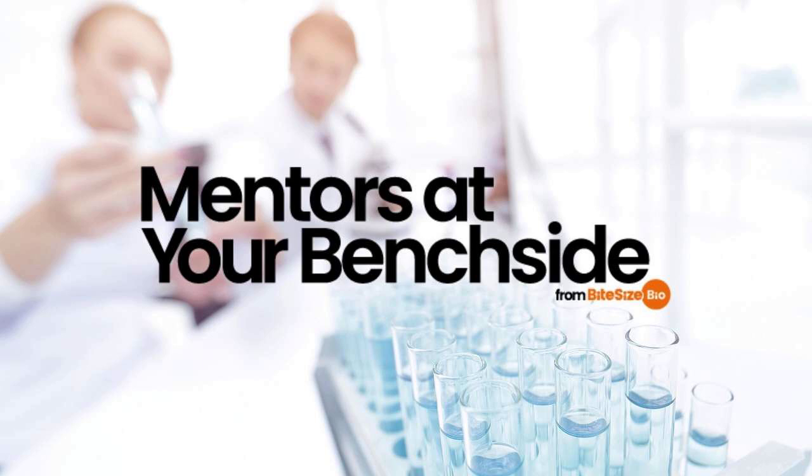I'm Thomas Warwick, and today I'll be talking to you about different fixatives for flow cytometry. Fixation is routinely used in histology and cytology labs the world over as a way of keeping cells in stasis at a particular point to ensure that by the time they're examined, they've not deteriorated and the things you want to see are still there. This is also something that we often want to do in flow cytometry experiments. But there are several fixatives you can choose, and your sample type and downstream experiments impact your choice.